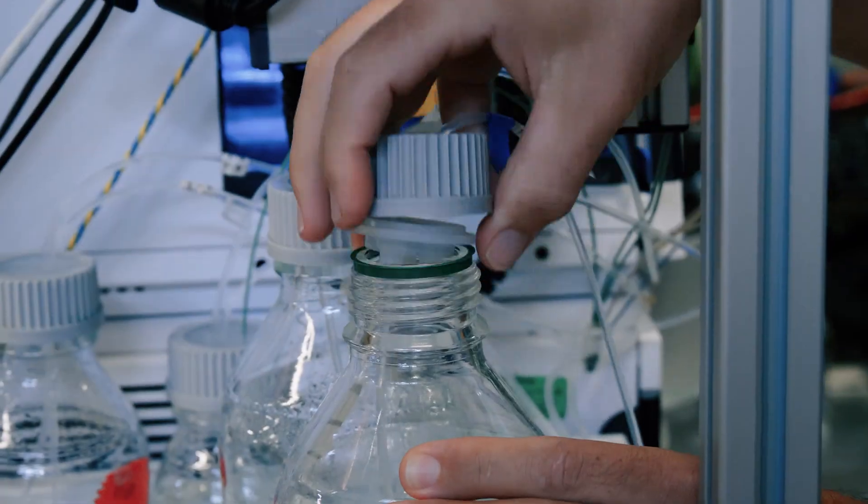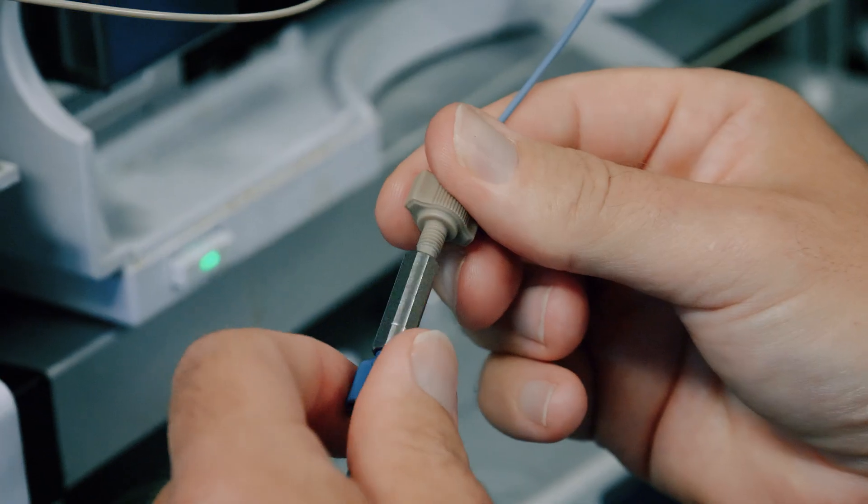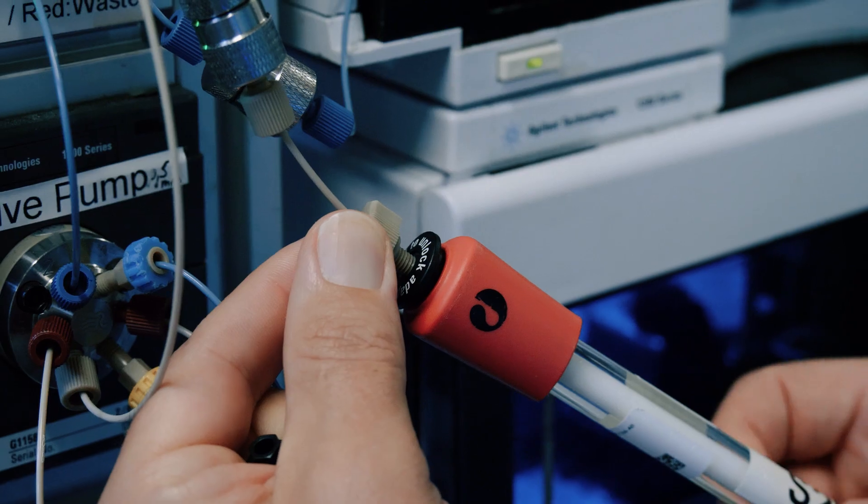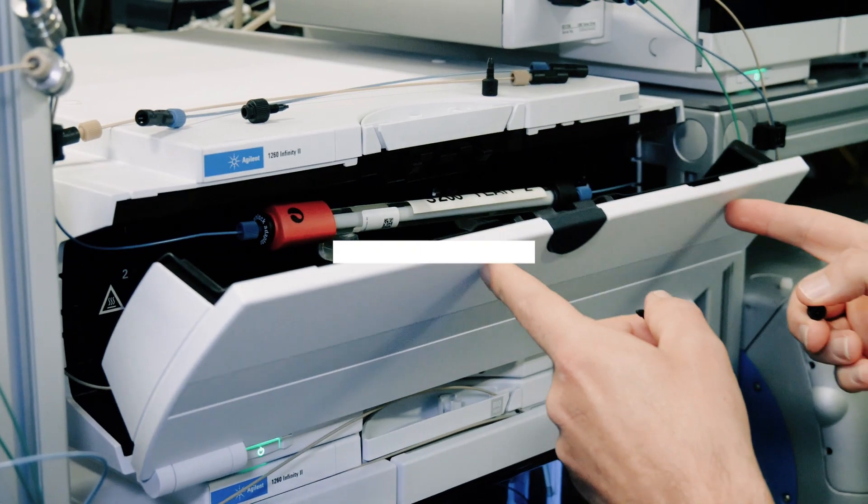How to perform a purge on the HPLC system and connect SEC columns.